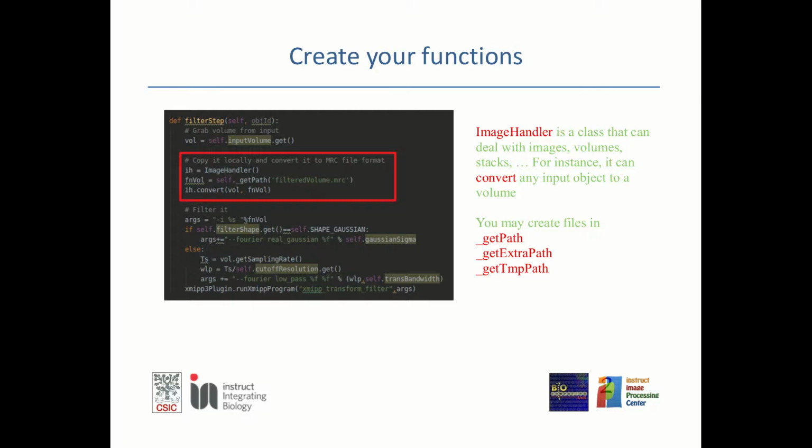So for instance, let's say, although this is not the case for XMIPP, just to illustrate how you could do this, that you want to write your volume as an MRC file for processing it.